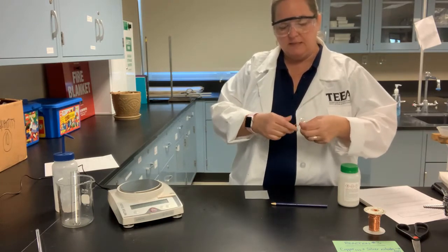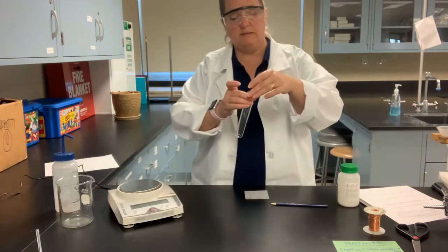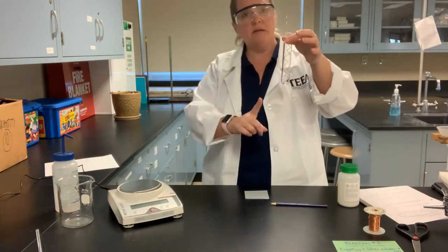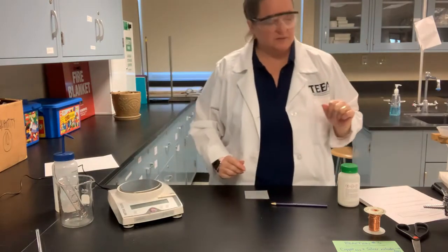So I'm bending this into this shape so that it will fit nicely into a test tube and give me a lot more surface area than I would get if I simply placed it in there with a straight length of copper wire. So there is my copper wire that's prepped and ready to go.